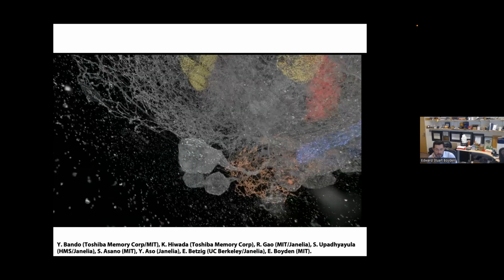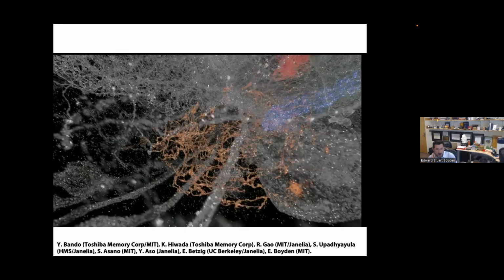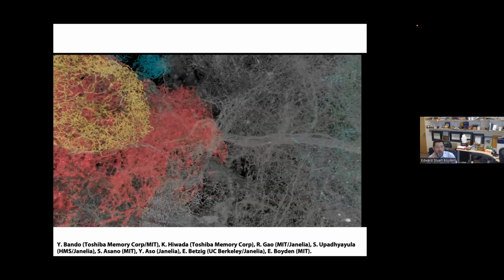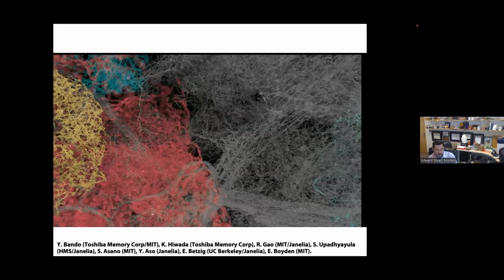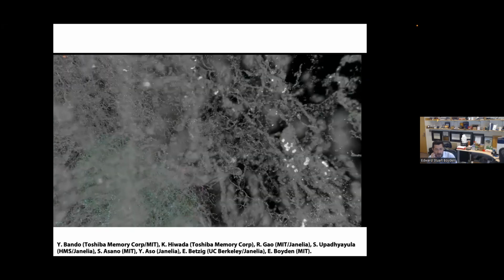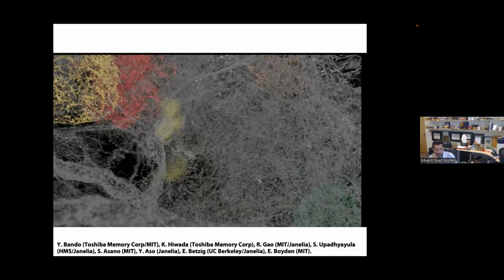So expansion not only democratizes nanoimaging for ordinary microscopes, but if you're willing to use a specialized microscope, you can image very large-scale objects, even entire brains in their intact state in a single setting.